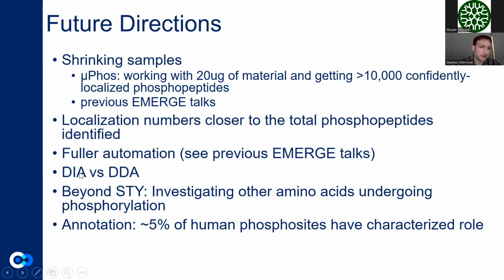And then there are also stronger papers that have been coming out showing how DIA has been improving over the DDA results for phosphoprotein identification and localization. And DIA-PASEF is one of the methods being used to be comparable to DDA, with the advantage of shrinking the length of time spent acquiring the data.